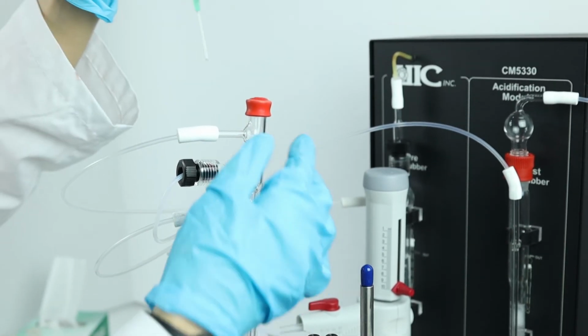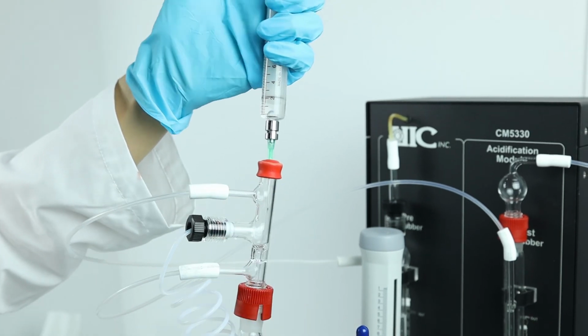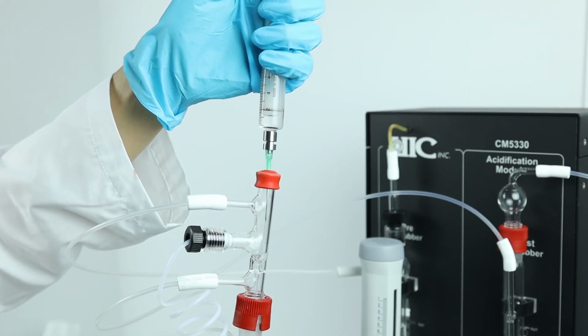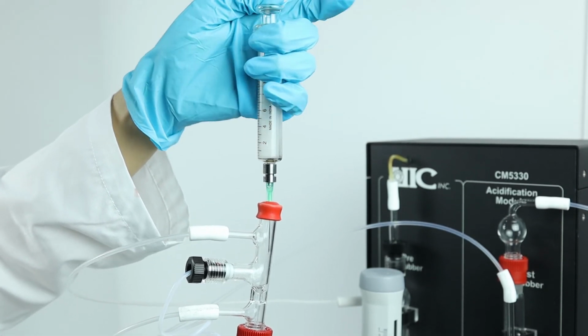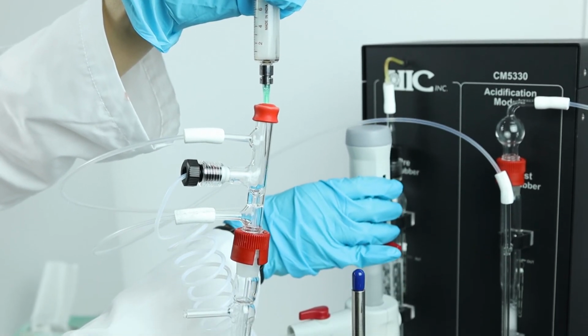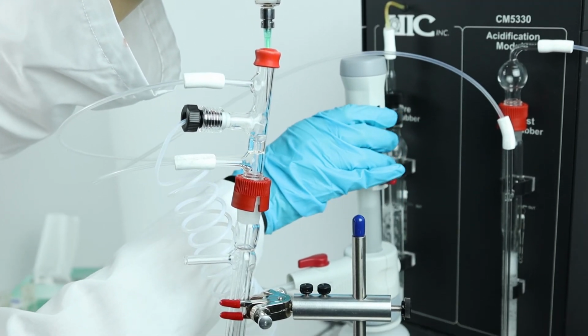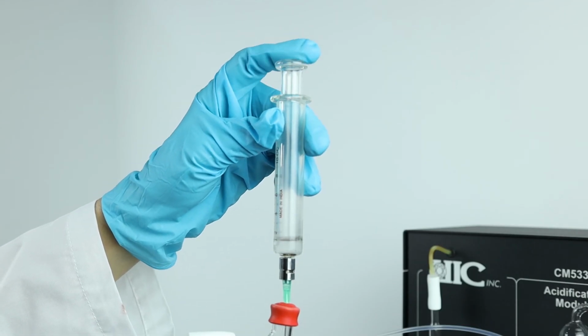Pierce the septum with the syringe so that the needle reaches below the second finger of the 3-finger adapter. Press down to release your sample. Be sure to wash the sample down with 10 ml of acid and to hold down on the syringe while dispensing your sample, or the pressure of the system will cause the plunger to be pushed up.